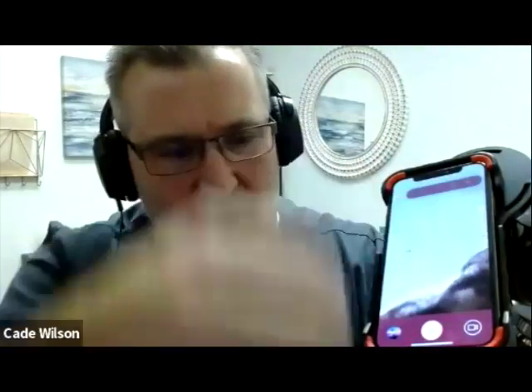Try to unlock the full potential of our phones. My phone says that it can only video to 6 power, right? Everybody saw that. Well, I can go to 10 power with my app. And so I'm at 10 power on top of, look at his little leg right there, what my microscope normally does. So I'm at 600 power just using my lowest objective, and that's on the free version of the app.